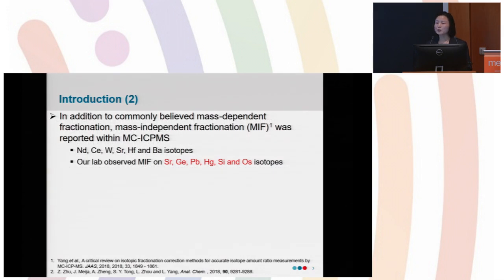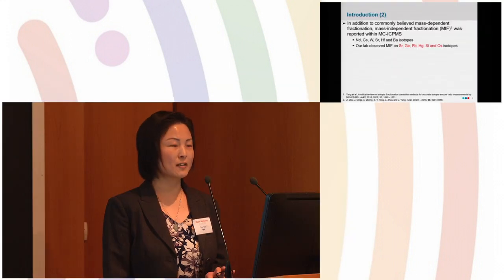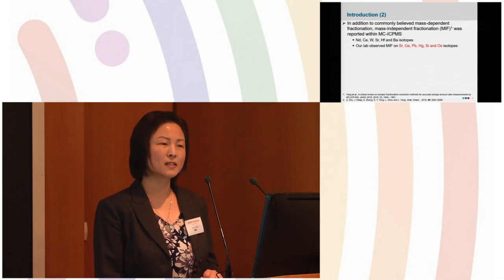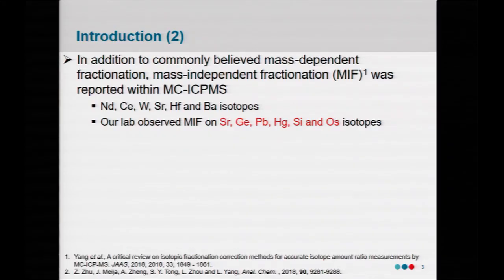In addition to the commonly believed mass-dependent fractionation observed within MC-ICPMS, mass-independent fractionation was also reported with MC-ICPMS for a number of elements, such as neodymium, cerium, tungsten, strontium, hafnium, barium. Our laboratory also observed mass-independent fractionation on strontium, germanium, lead, mercury, silicon, osmium.